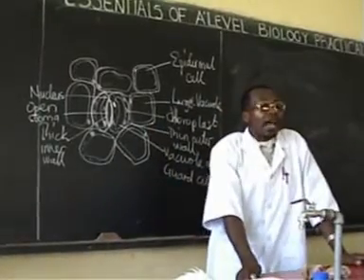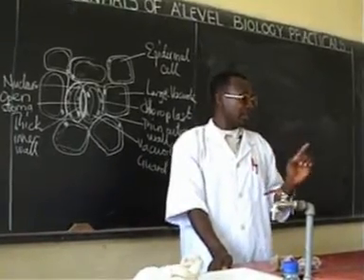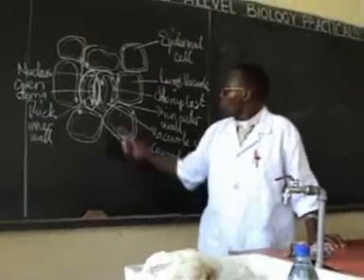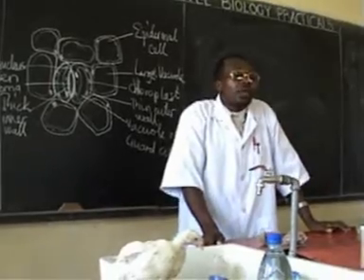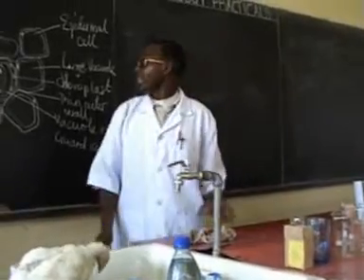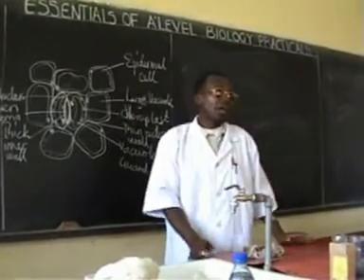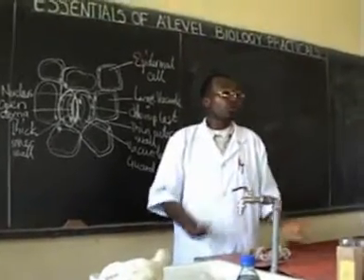So usually candidates are advised that when they are observing their preparations, they should be very careful about the differences they note, because there will always be differences, and after the observation, some questions are always asked concerning the observations that we are making. Another mistake that candidates make is that they do not carry out the experiment themselves. They will pretend and think that they already know. But I want to tell the candidates that solutions are given from any side. You can have an acid, you can have an alkaline, you can have water, you can have a salt solution. All of them will be clear.